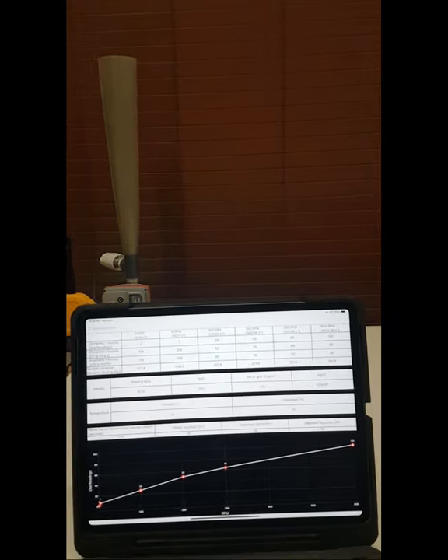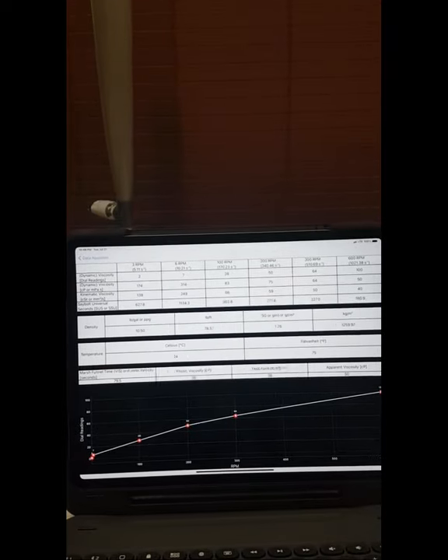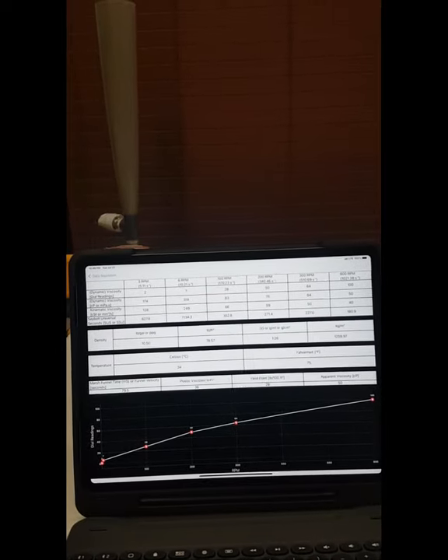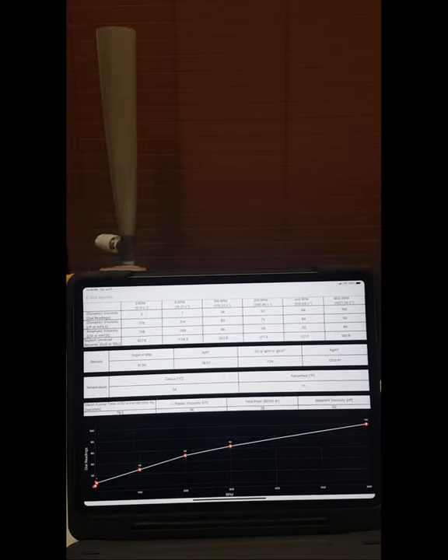First, the pressure is zeroed and the goblet is filled with drilling mud. The vessel can be easily connected to a process flow line for automated filling. Then the start button is pressed, followed by the remote control to begin the flow. Once the drainage is complete, the Thief Goblet app automatically displays various properties of the drilling mud in appropriate units.